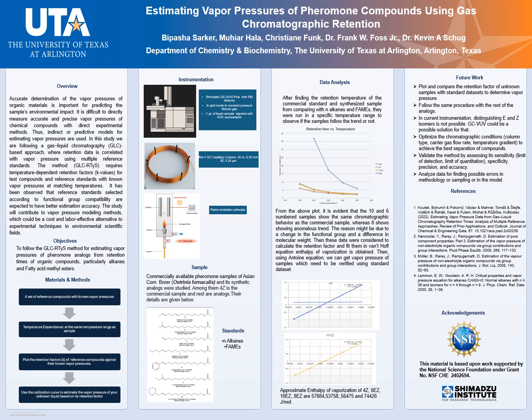My title is Estimating Vapor Pressures of Pheromone Compounds Using Gas Chromatographic Retention. Accurate determination of vapor pressures of organic materials is important for predicting samples' environmental impact, but it is difficult to directly measure accurately because it is a costly and lengthy process.